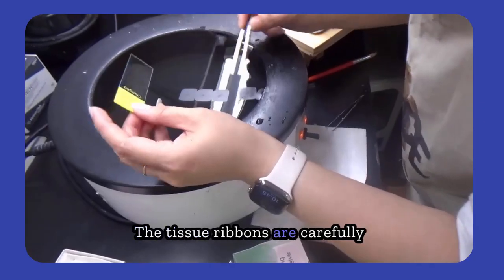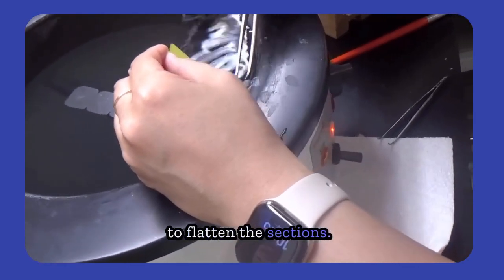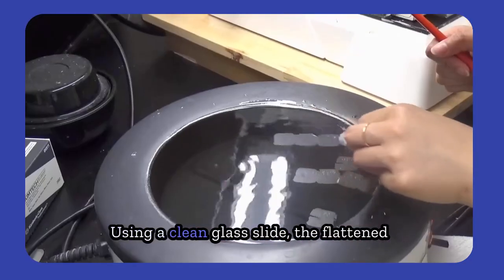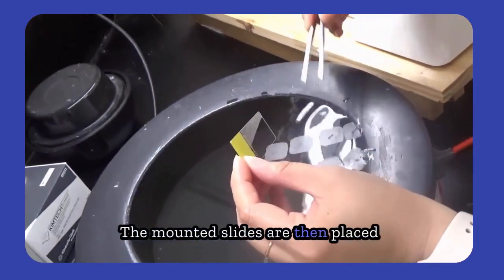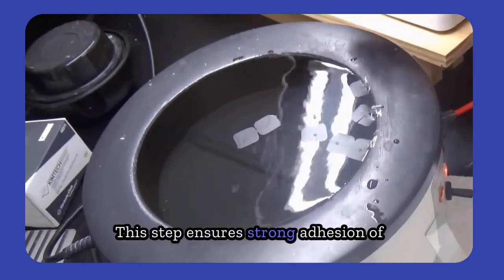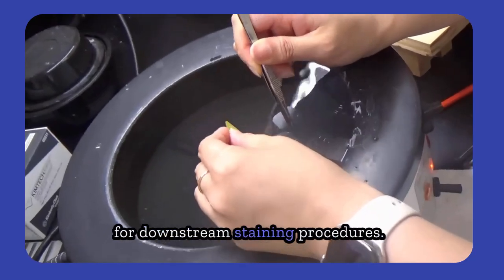The tissue ribbons are carefully transferred onto the surface of a 40 to 45 degrees Celsius warm water bath to flatten the sections. Make sure no bubbles or residues are under the tissues. Using a clean glass slide, the flattened section is gently picked up and mounted without trapping air bubbles. The mounted slides are then placed on a warming tray or in an oven to thoroughly dry the sections, ensuring strong adhesion of the tissue to the slide and preparing it for downstream staining procedures.